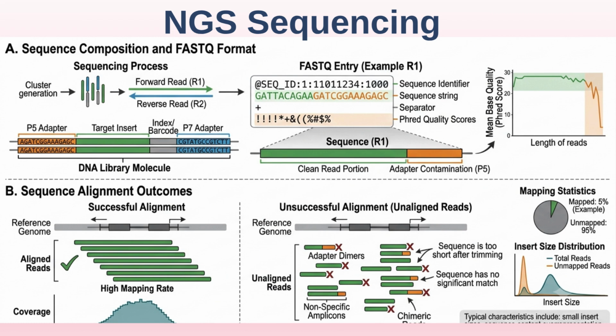After this pre-processing step, bioinformatics tools are used to assemble the short reads into longer contiguous sequences, known as contigs, and subsequently into draft genome assemblies. This step reconstructs the original genome from the fragmented sequencing data.